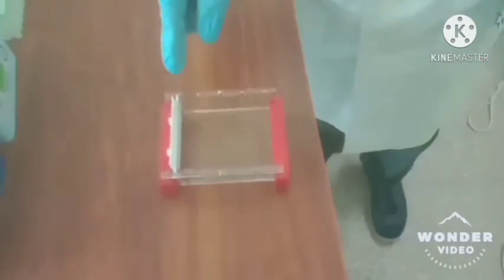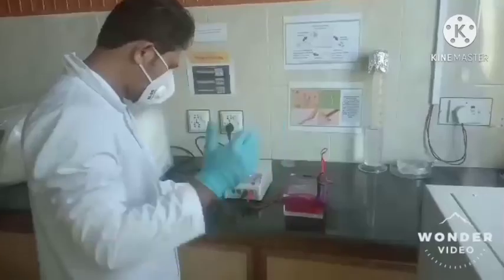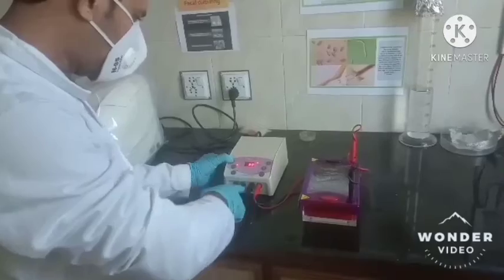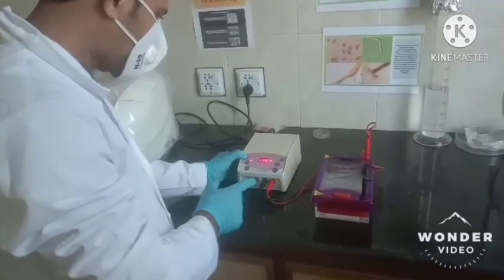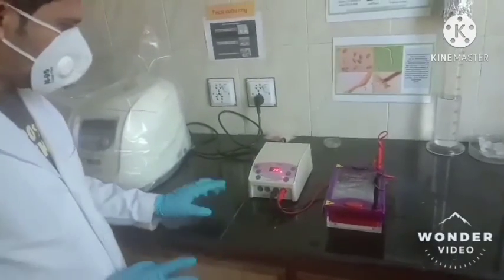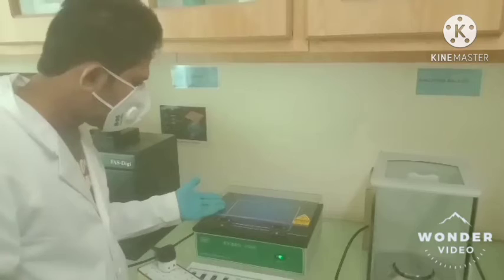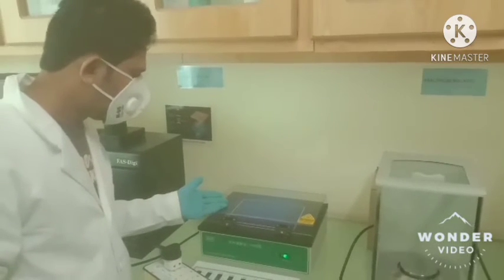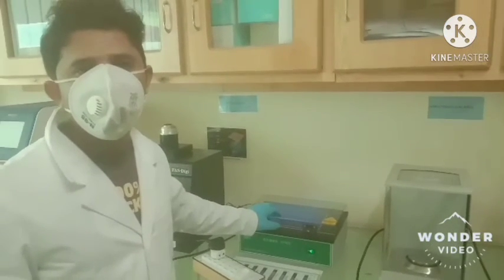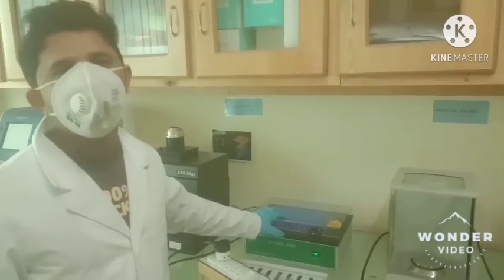The comb is inserted and the wells are allowed to set. Then placed into the tank, we will run at around 90 volts with a current of 400 milliamps for 30 minutes and then start the reaction. After completion, the gel is examined under the UV light system and the picture confirms the positive result. The ladder pattern obtained confirms that the LAMP assay has been successfully developed for the detection of MAP.